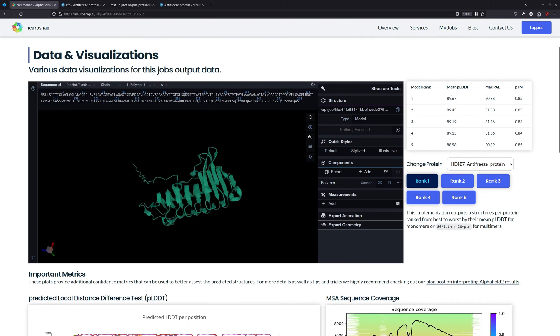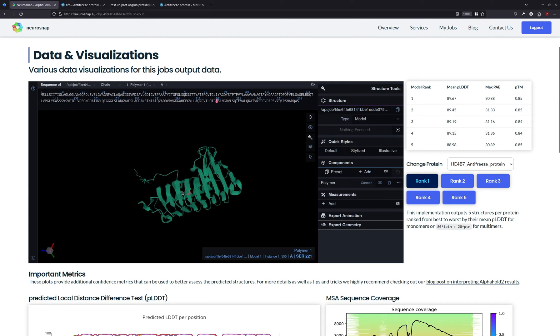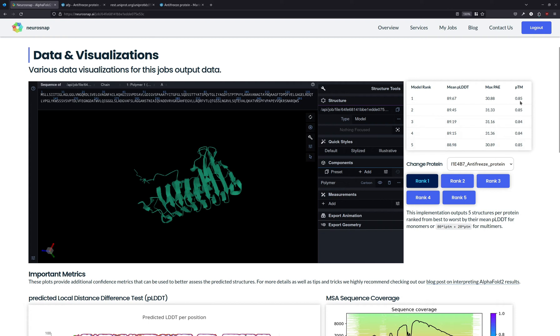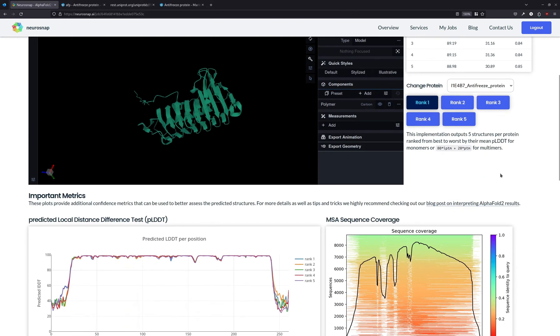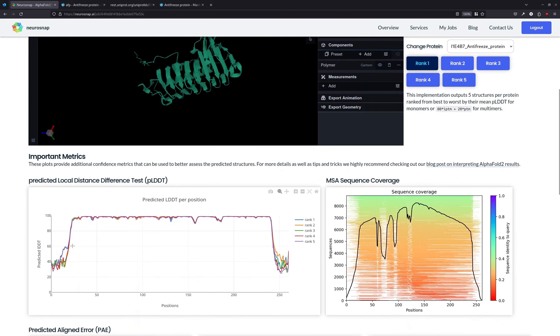The average PLDDT is very high, so the maximum value you can have for this is 100. And generally when you see high values like 89 or anything around that range, that's usually a very good sign. The PTM metric is also around 0.85, so this is a good sign.